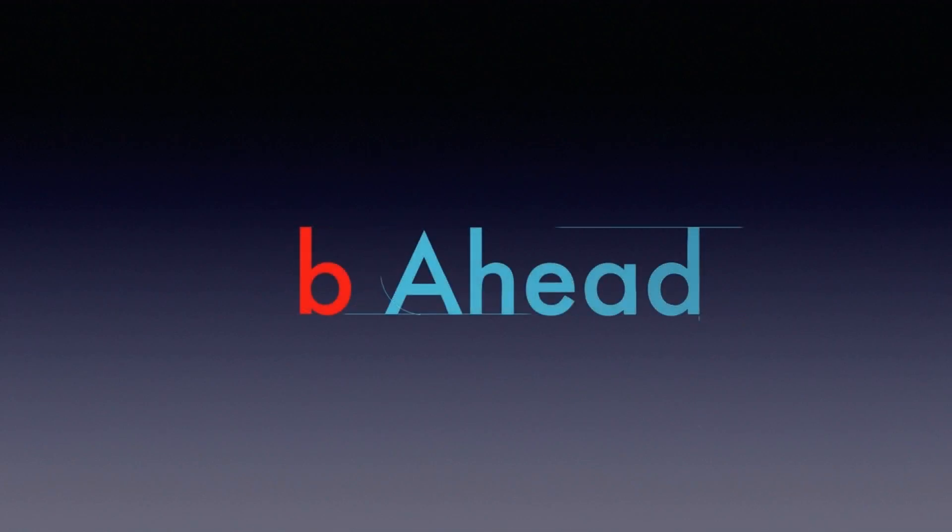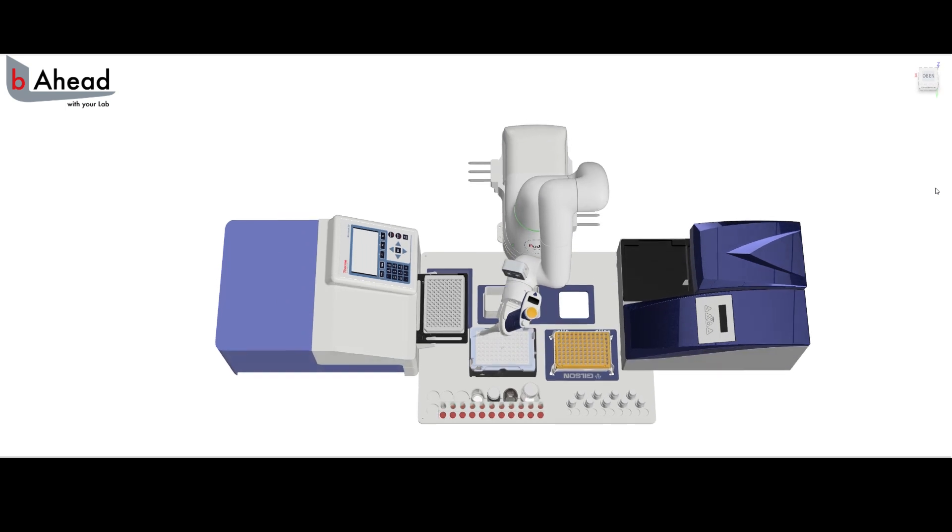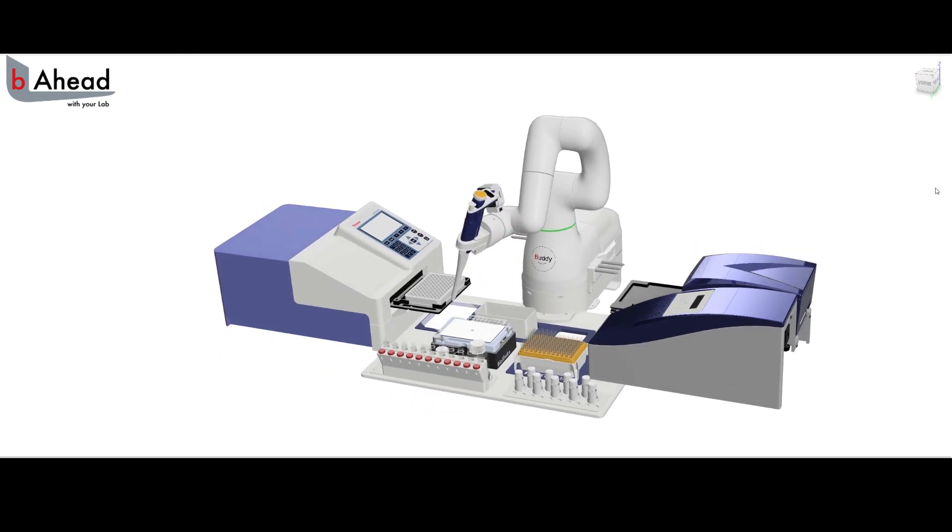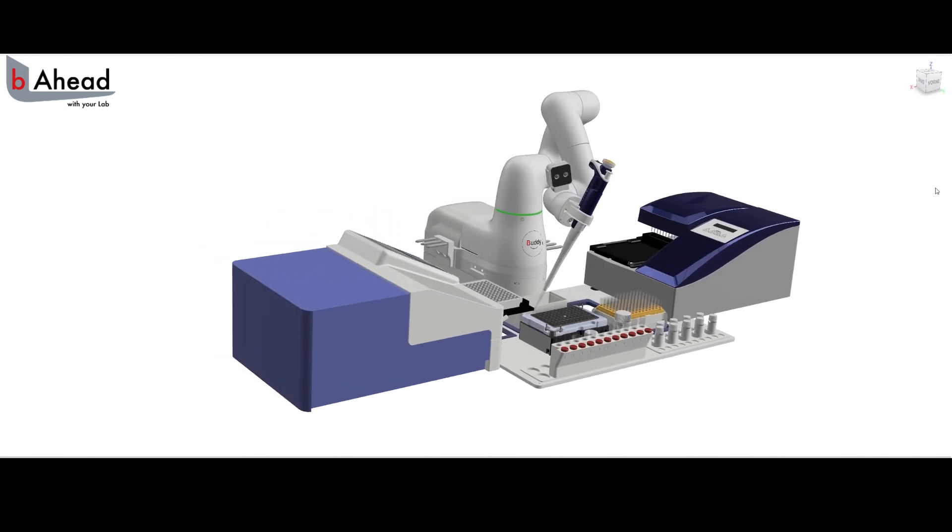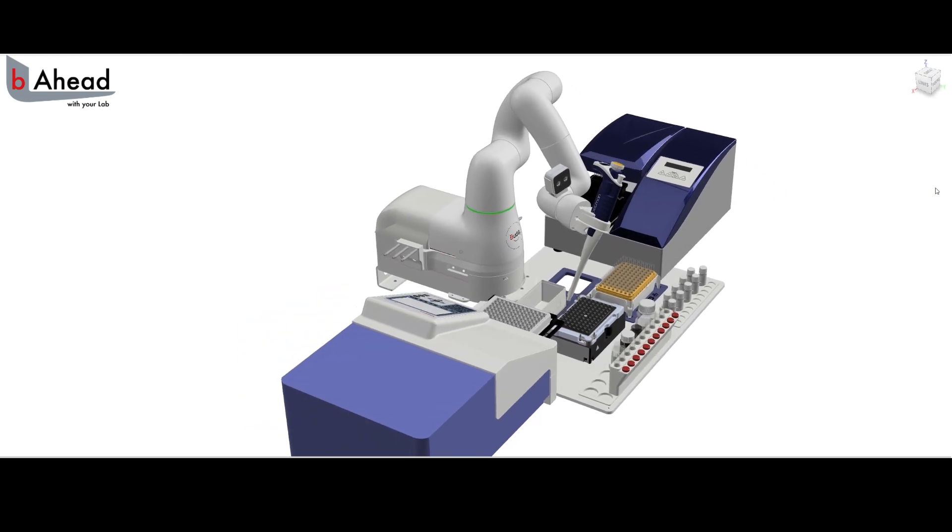Hello and welcome to our presentation of our most recent workflow. This application is based on an enzyme immunoassay which contains multiple standard liquids, two controls, a start and stop solution, and requires more than 300 steps by the robot, including multiple changes of tools.